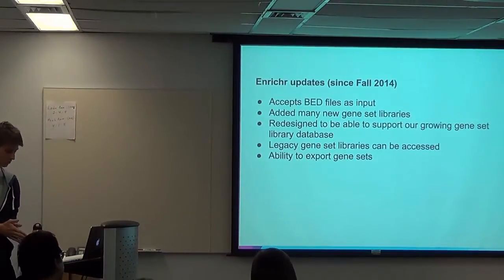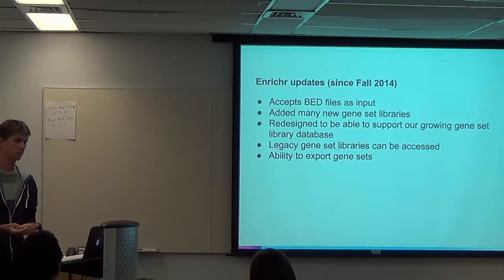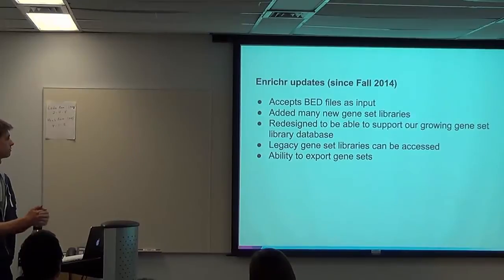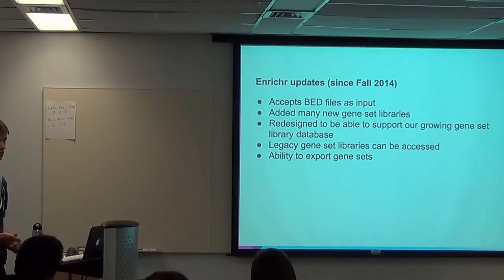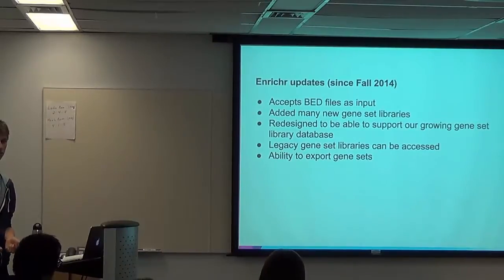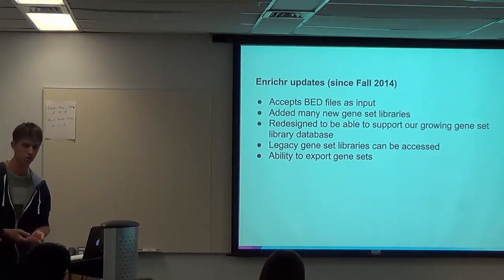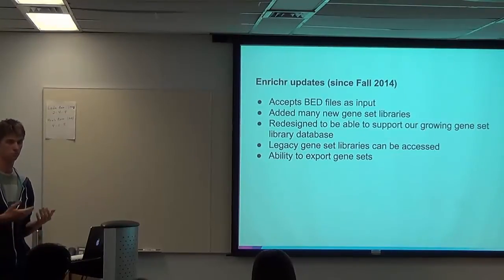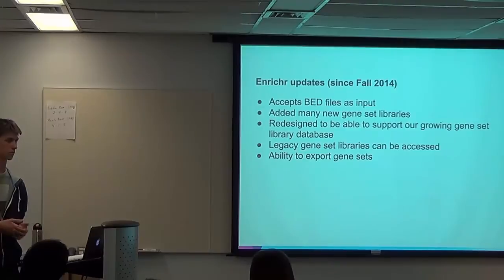So since I've joined the Mayan lab, I've been working on Enrichr, and the updates I've completed so far are accepting bed files as input, and so this works by first converting a bed file into a gene list, and then performing the enrichment analysis on this gene list. And you can view the constructed gene list in the results page if you're interested in that.